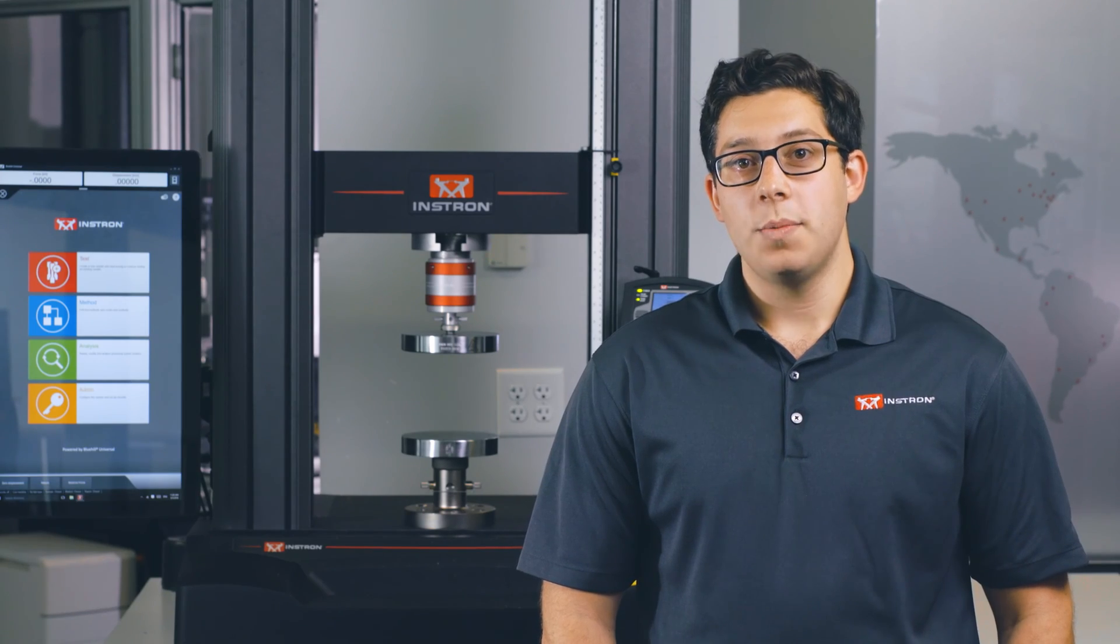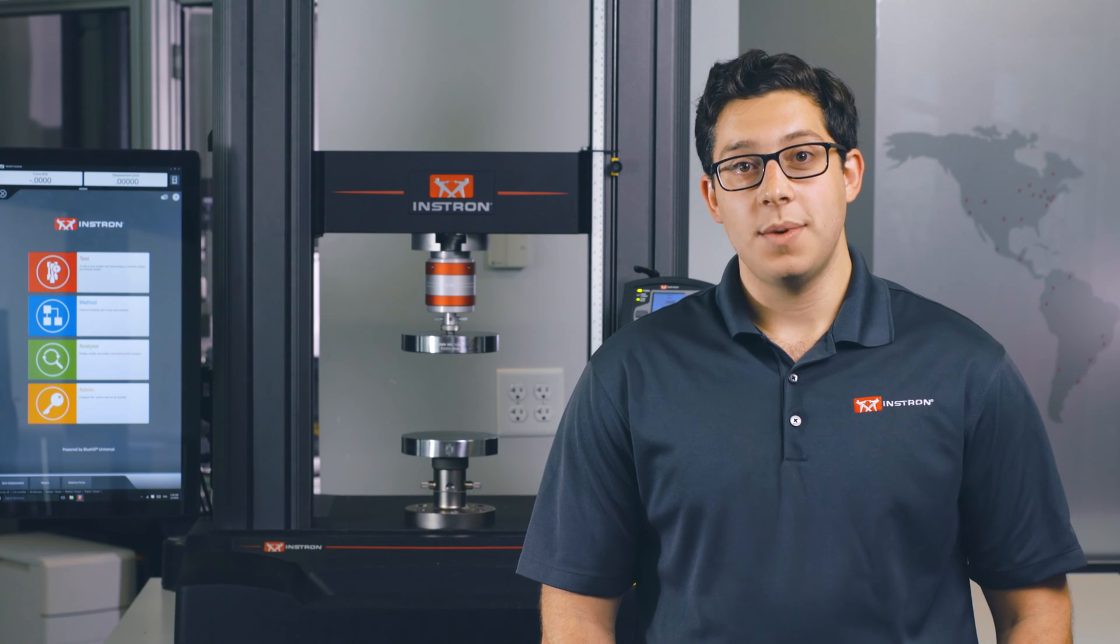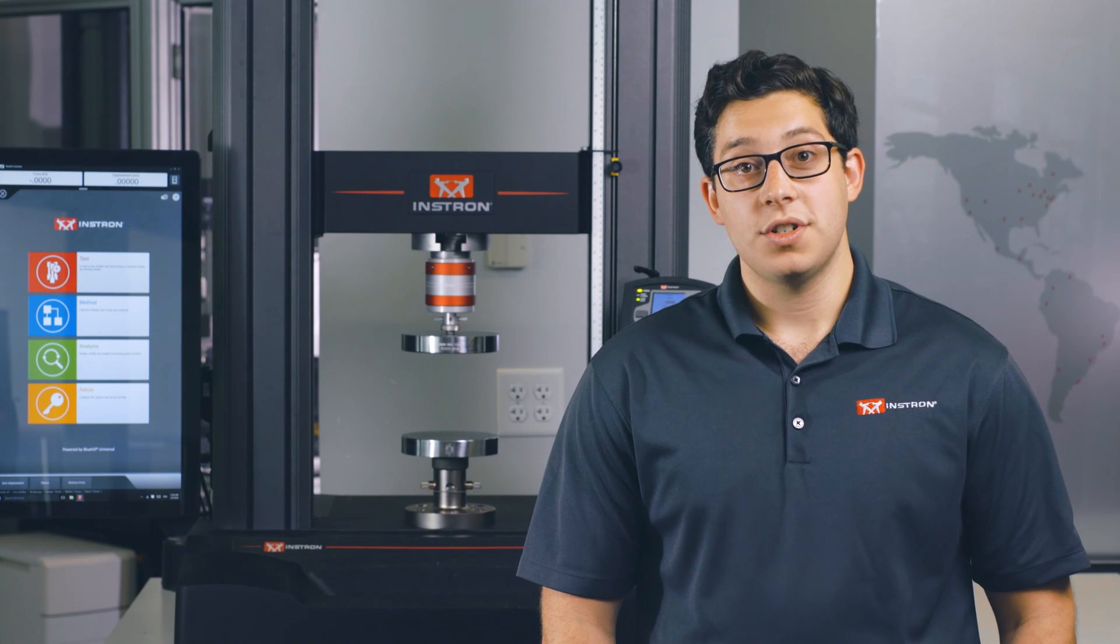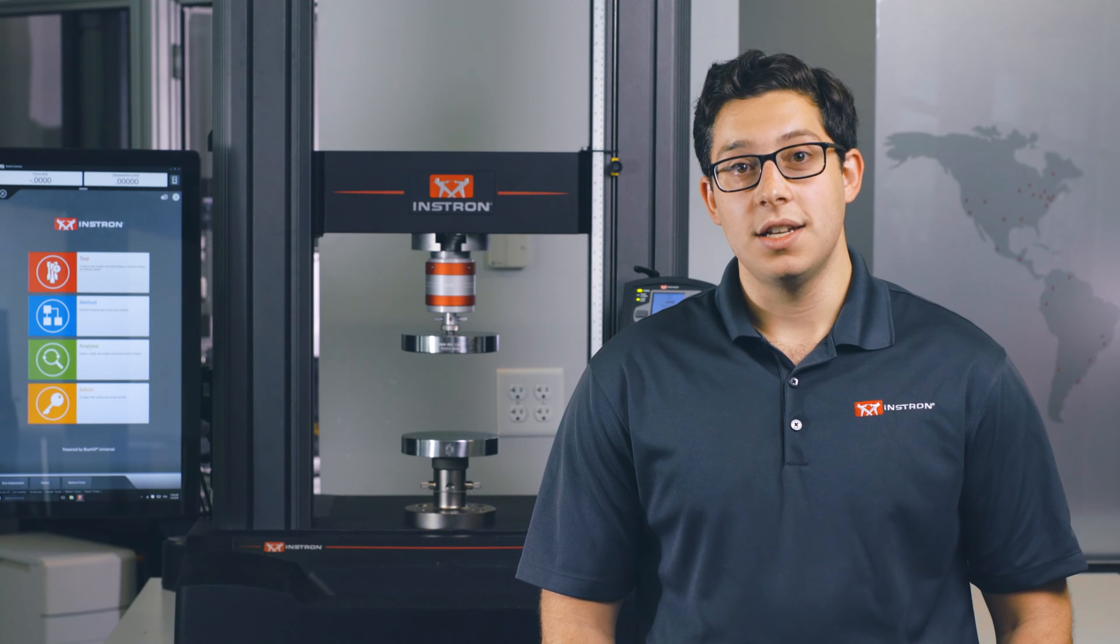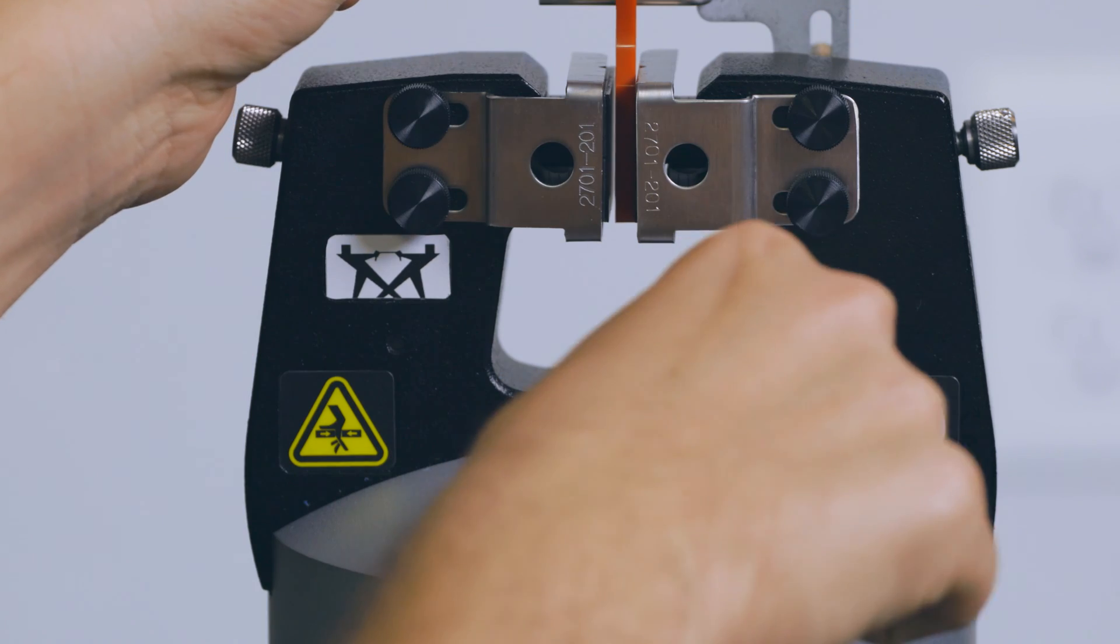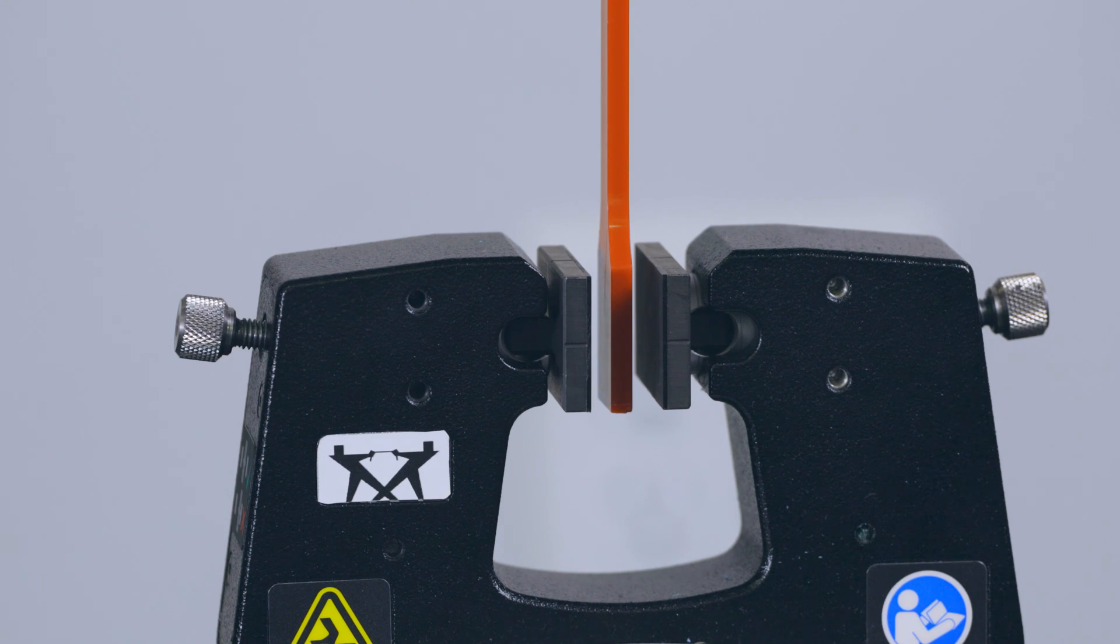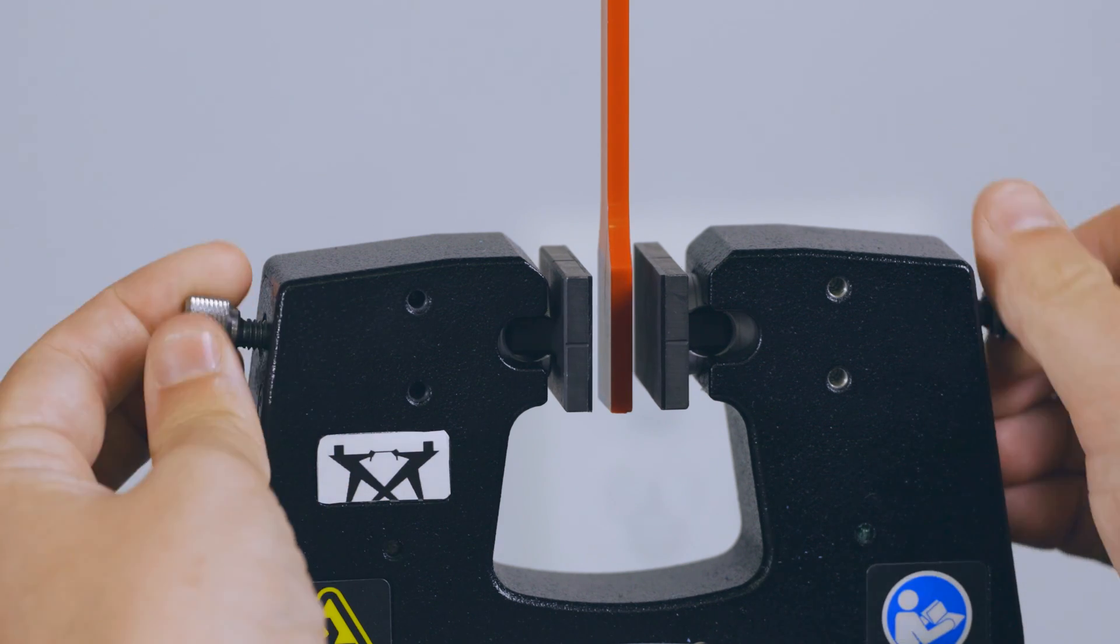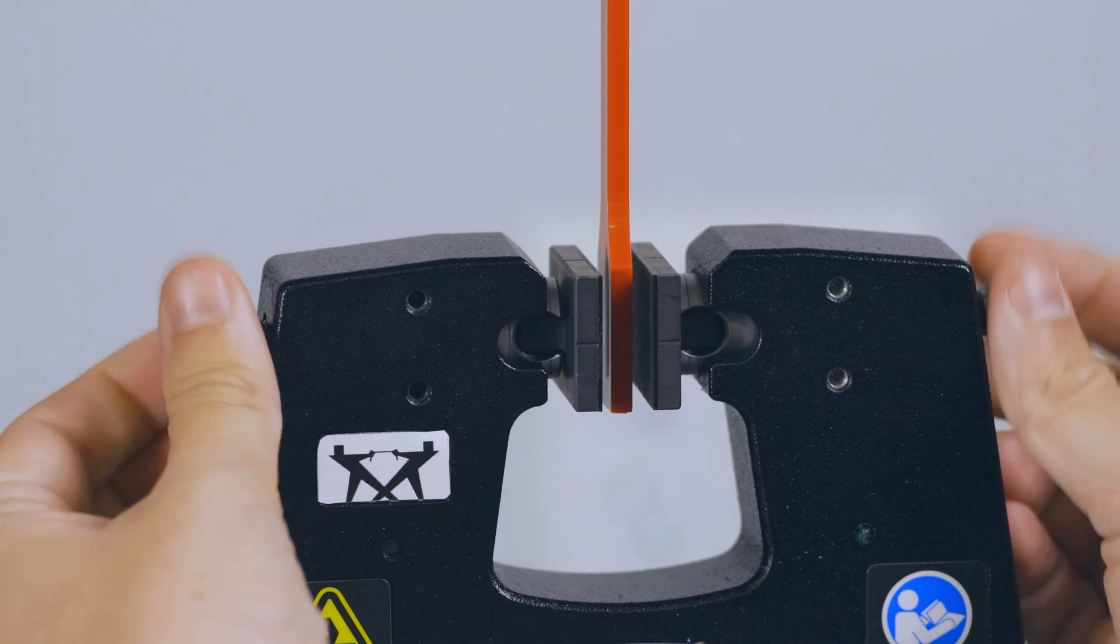Pneumatic grips have a wide opening range to accommodate a variety of specimen thicknesses. It is important to close this gap if it is not needed to eliminate the possibility of a finger pinch. You can do this in one of two ways. First is the utilization of jaw face shields. If you don't have these, you can use the knobs on the side of the grips to manually bring the faces closer together.